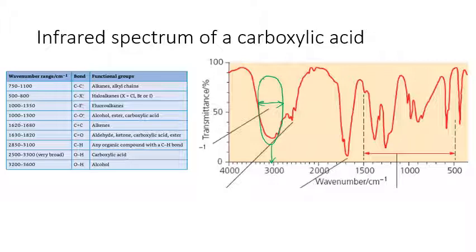It could be either of these theoretically, right? But you can see compared to the alcohol hydroxyl group, it's shifted to the right, lower wave numbers, right? So we're going to make out that it's this bond that is making that peak, all right? It's the oxygen-hydrogen bond in a hydroxyl group of a carboxylic acid, all right?